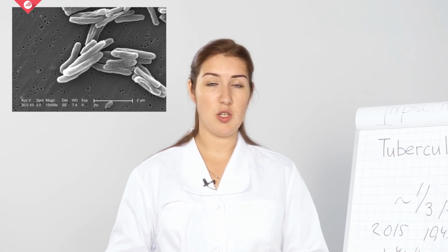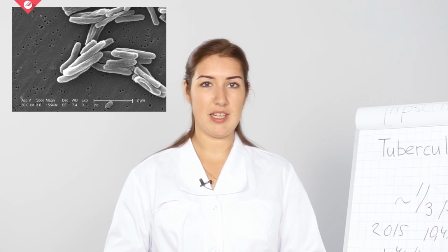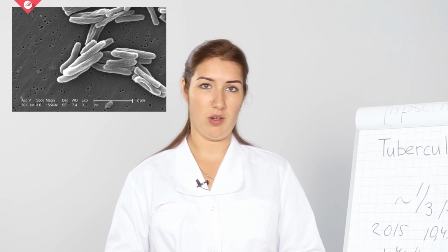If the gram stain is performed on the clinical samples, then Mycobacterium either stains very weakly gram-positive or does not retain dye because of the high lipid and mycolic acid content in its cell wall. Since Mycobacterium retain dye even if it was treated with acidic solution, it is classified as acid-fast bacteria.